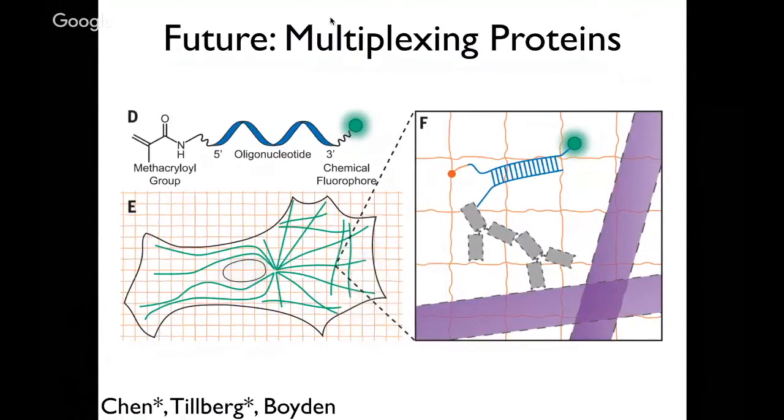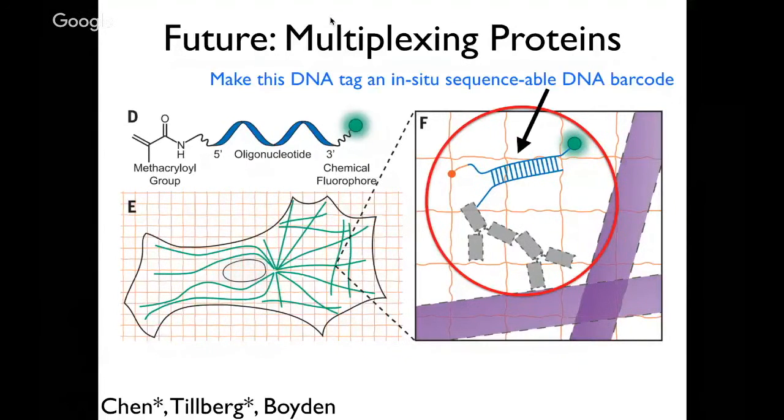Okay, perfect. So anyway, closing up here, but we would like to also use the DNA that naturally happens in the expansion microscopy process, and actually use that as a barcode to tag different proteins that are present in the sample as well.